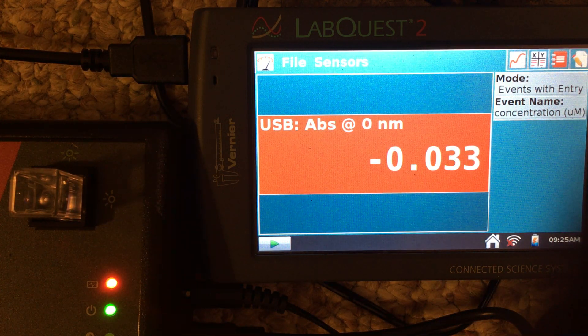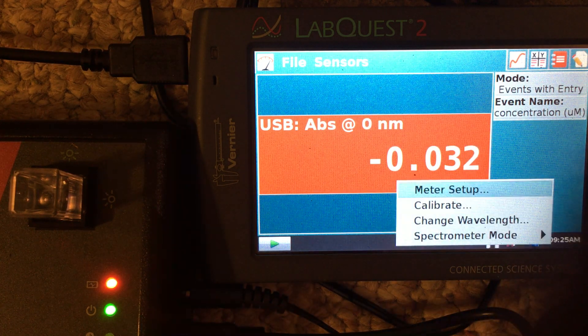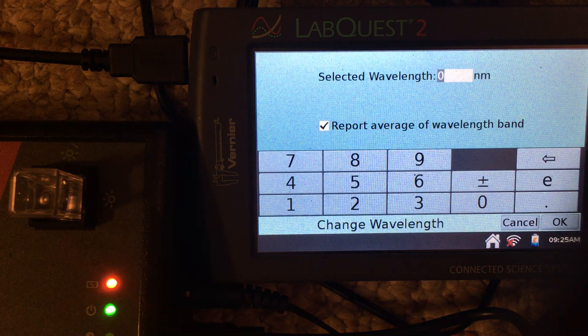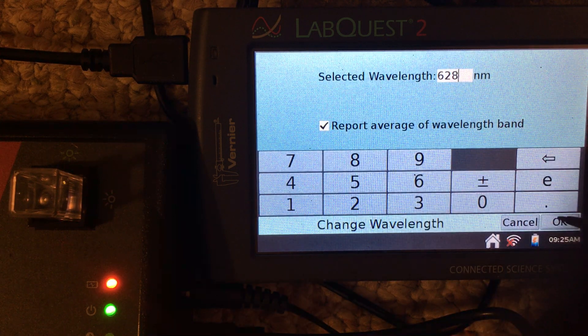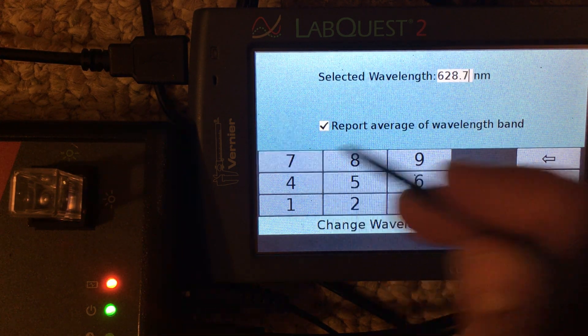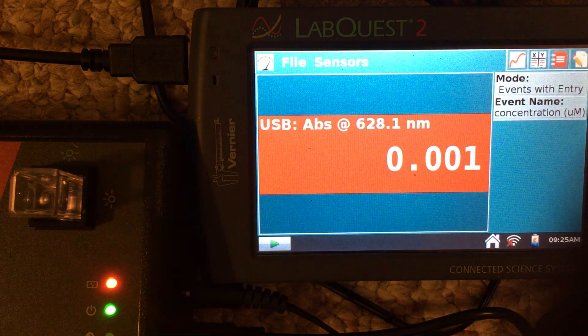We want to measure the absorbance at the right wavelength, so to change the wavelength, we tap on the red box and go to change wavelength. The wavelength we are selecting in this case is 628.7 nm. Hit OK, and now we're measuring at the right wavelength.